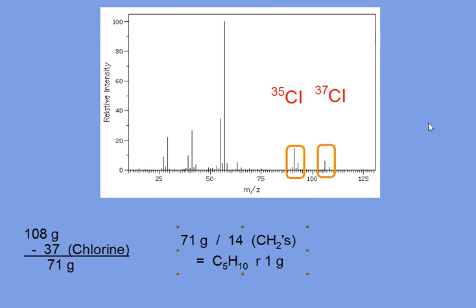And that's what we'll divide by 14 into the number of CH2 units, which seems to go in just over 5 times with 1 extra unit. So that 1 extra unit is most easily explained with an extra hydrogen. So it looks like the formula is C5H11Cl. And of course the chlorine is taking the place of a hydrogen that we'd normally find.